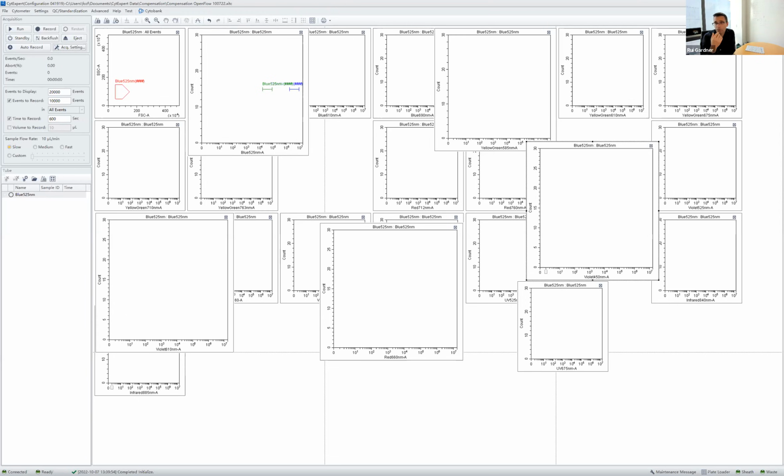And then what Kathy also was mentioning is that, at least in the context of a core facility where we're trying to teach best practices, it's also a bit hard to comfortably tell people, oh, for this instrument you can do that, for those other instruments you can't. And so we tend to just teach everyone as much as possible how to use best practices. And in all other systems, you need to make sure that you use the same gains or the same voltages, right? So I think that makes it a bit easier to make sure that everyone is doing the best for cytometry.